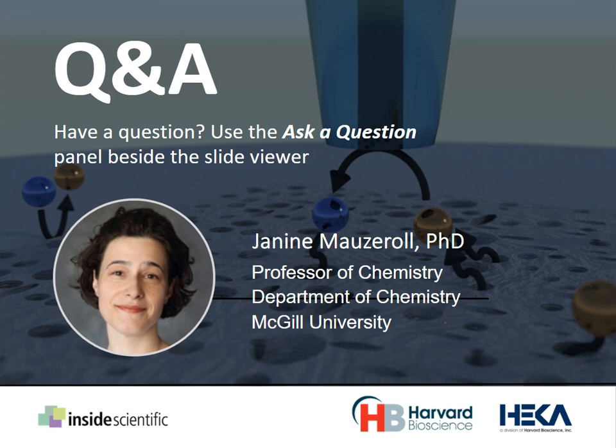I'd say that the SVET probes are less developed than SECM probes at the moment. They tend to be much bigger. The entire tip is usually around 100 micron. So that means your lateral resolution won't be that good. So I would say maybe you can't do the inclusion, but if your objective was, for example, to measure galvanic corrosion between two dissimilar metals, that could be quite good.